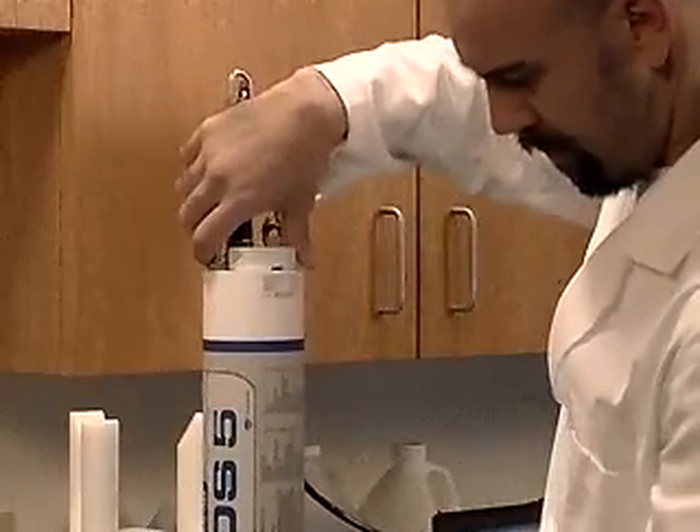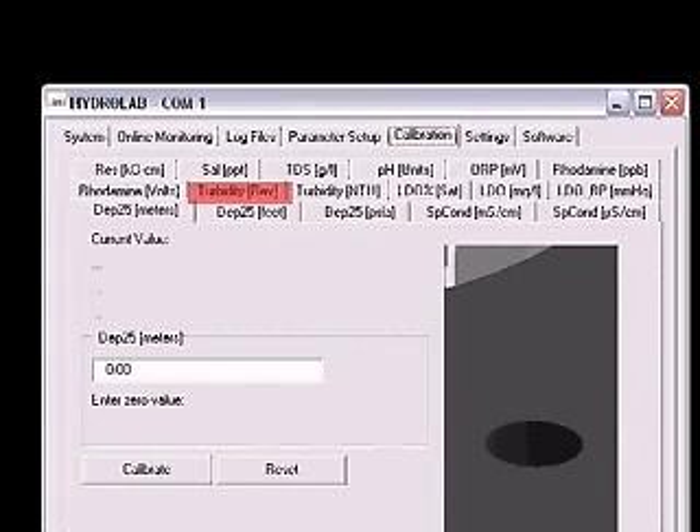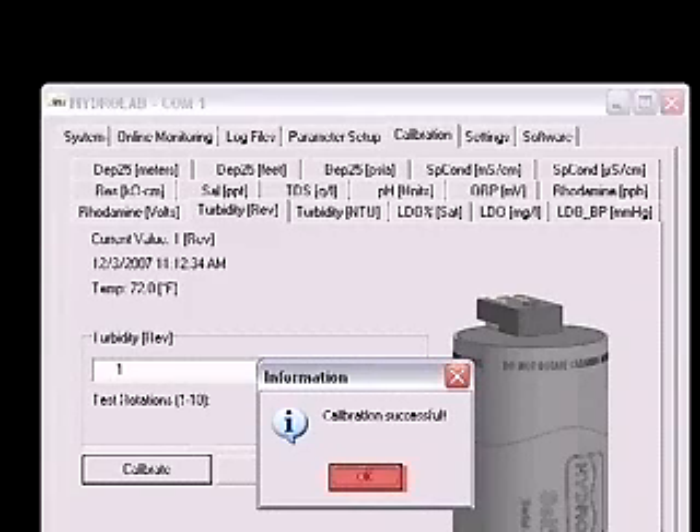In Hydrus 3LT, click on the Calibration tab, then click on the Turbidity Rev tab. You should see a picture of the self-cleaning turbidity sensor. Verify that the value in the box is 1 and click the Calibrate button. The wiper should make one complete revolution, removing any air bubbles from the optics. Click the OK button in the Calibration Successful window.